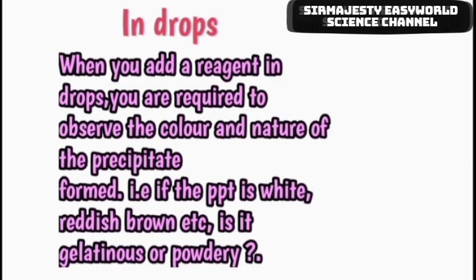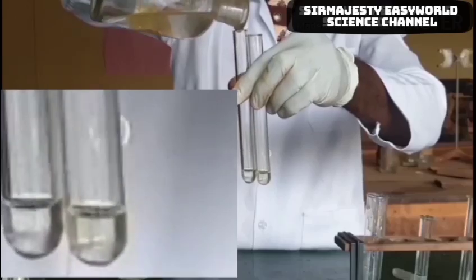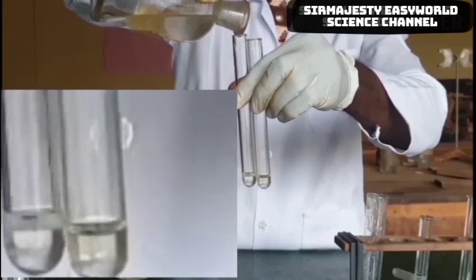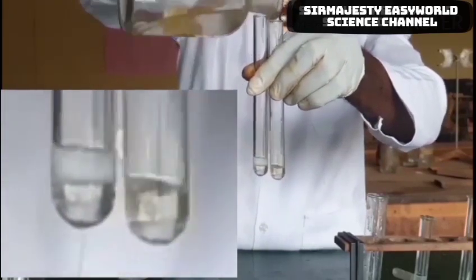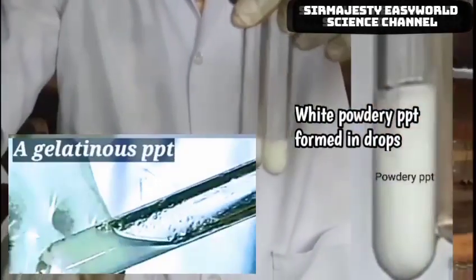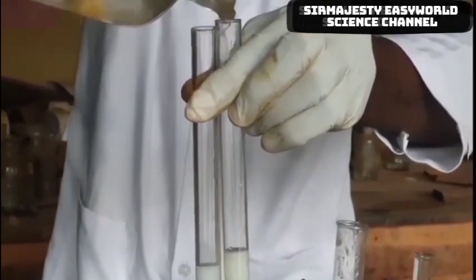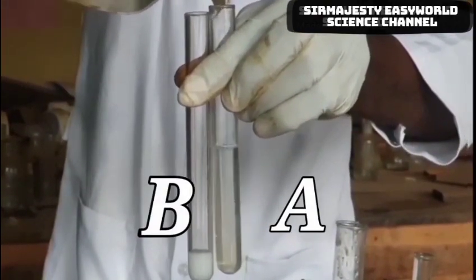In drops, you are expected to check the color and nature of the precipitate — checking if it is white, green, gelatinous, or powdery. Here is an illustration: we are adding now in drops. You see the precipitate — this is white, powdery precipitate. It is not gelatinous, it is not sticky, it is powdery.